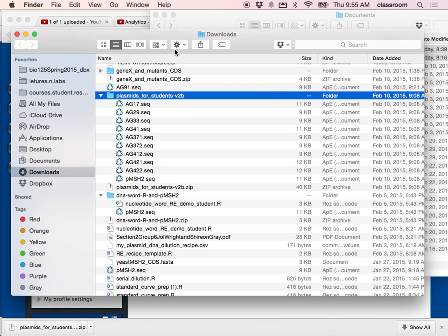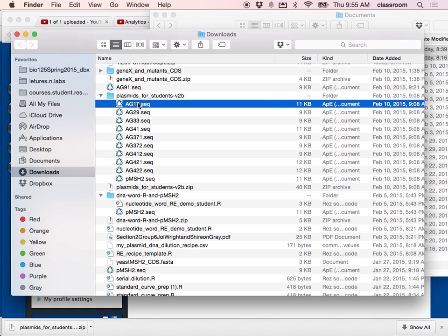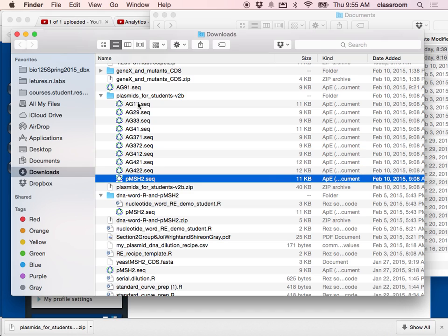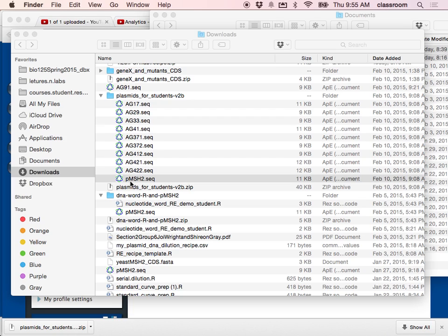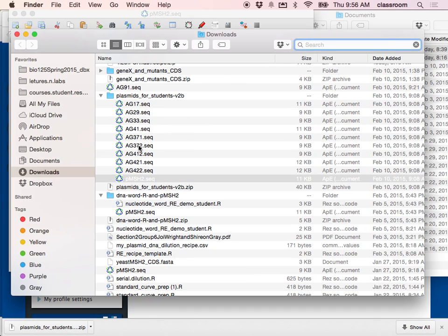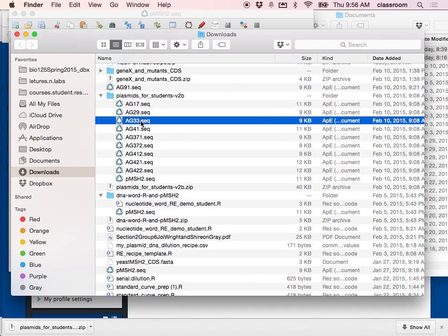After you download and extract the sequence file, you should find out which mutant you are working on. The wild type is the one you are going to use for all groups. I'm opening up the wild type sequence using APE. Then I'm going to pick a mutant sequence — for no particular reason I'm going to pick AG33.